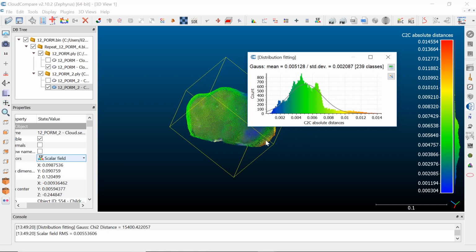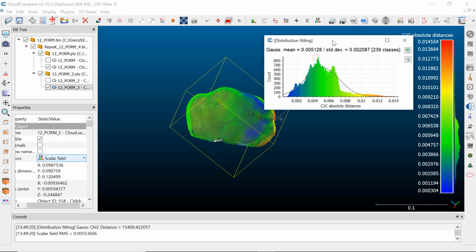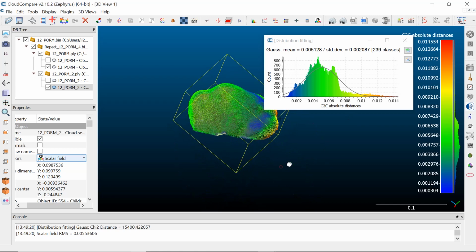So the advantage of this growth estimate from 3D models compared to coring a colony is not only that it's not invasive, but also that you look at all growth directions at once. In my paper, I called this growth radial extension because it takes place in a hemispherical fashion, but in some studies massive growth is also referred to as linear extension. Okay, so I would note this down as growth. That's it.